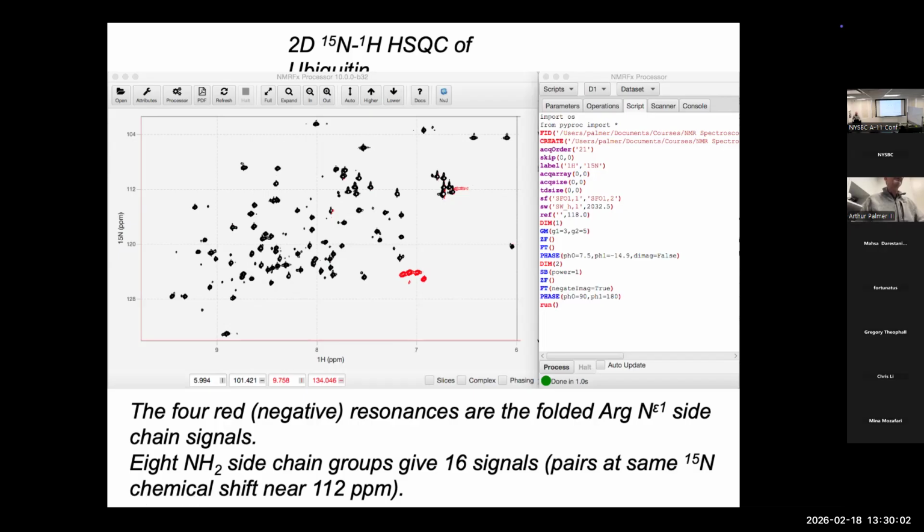As spectrometers have gotten more sensitive, you can get away with lower levels of deuterium in the sample in order to gain back a little bit of the lost sensitivity from the NDs. And occasionally, people use concentric NMR tubes so that the D2O is a thin film between the two concentric NMR tubes, and your sample has no D2O at all.